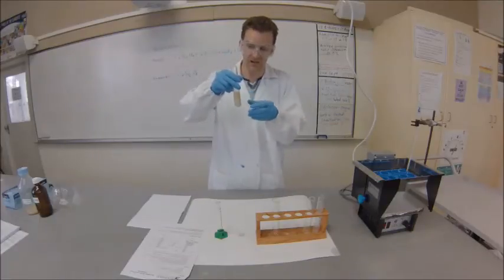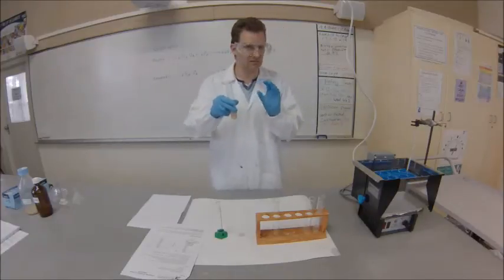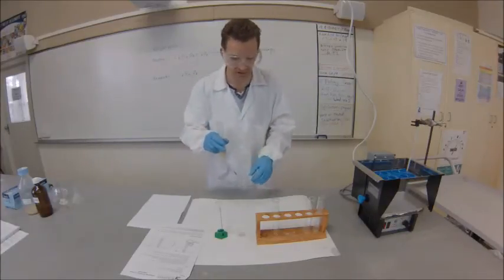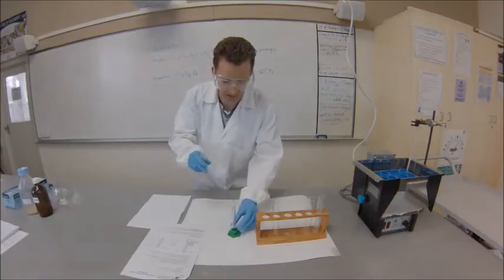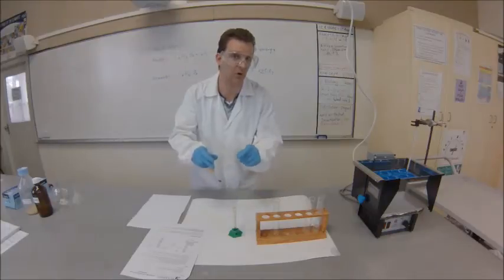Because they're incubated, respiration has already started. But it starts very slowly and accelerates, so the amount of gas we're producing and losing now is not that big - it won't be much of an error. We're going to pour this solution into our measuring cylinder and fill it all the way to the top.